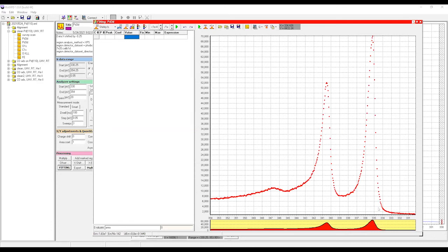However, it contains a small signal from some surface atoms of palladium which have a slightly shifted peak doublet. Also bulk palladium. Also there can be some chemicals on the surface, like some gas, or not gas, some carbon, and then all this would result in different doublets which overlap, and then they create this profile which you measure. And for XPS, usually you try to detect each individual state which you have.